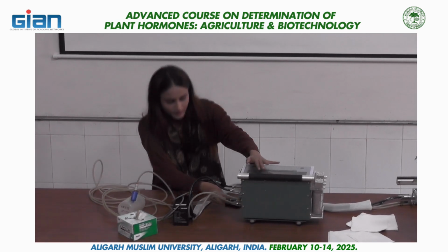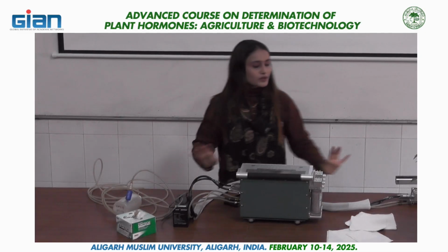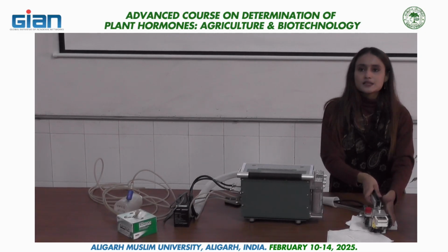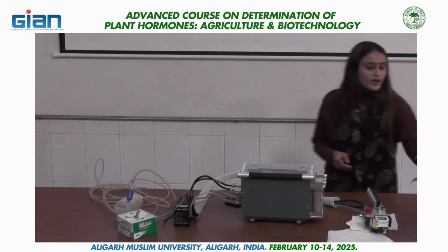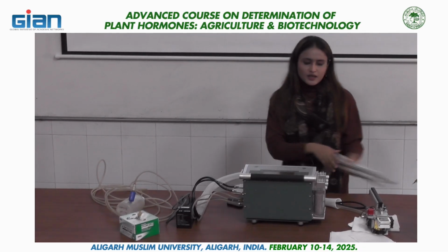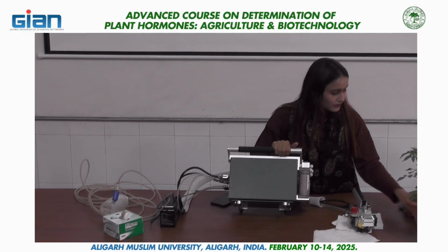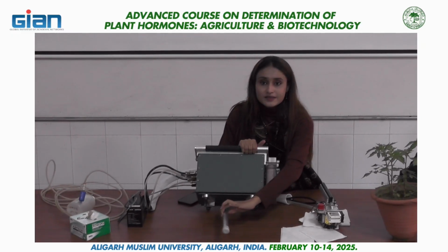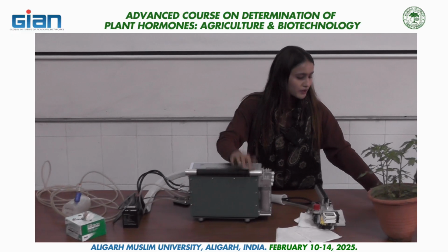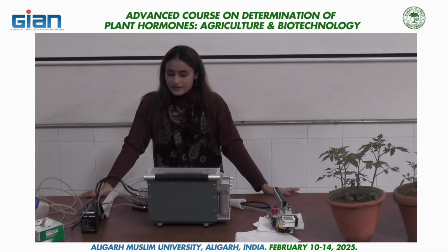This is battery. So now I am going to connect battery with this port. So now our IRGA is completely connected. If we are using it in field conditions, we can use this stand. This IRGA has a stand here which we can adjust, but now we are using it in the classroom, so there is no need to adjust this stand.